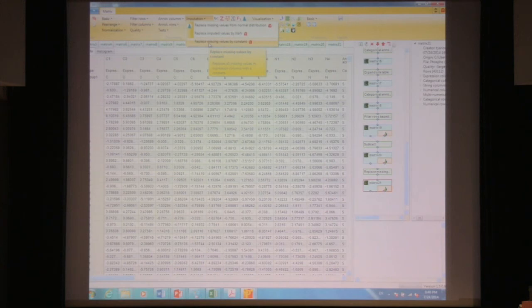One could use k-nearest neighbor. The problem is that it works very badly for things that are completely present in one group and completely absent in another. The k-nearest neighbor would look for correlations within the group where it's present, and what it finds are not markers for the distinction between the groups. That's a big problem with k-nearest neighbors. If somebody is critical about what we are doing here, one can just also do k-nearest neighbor and will find that it works much, much worse.